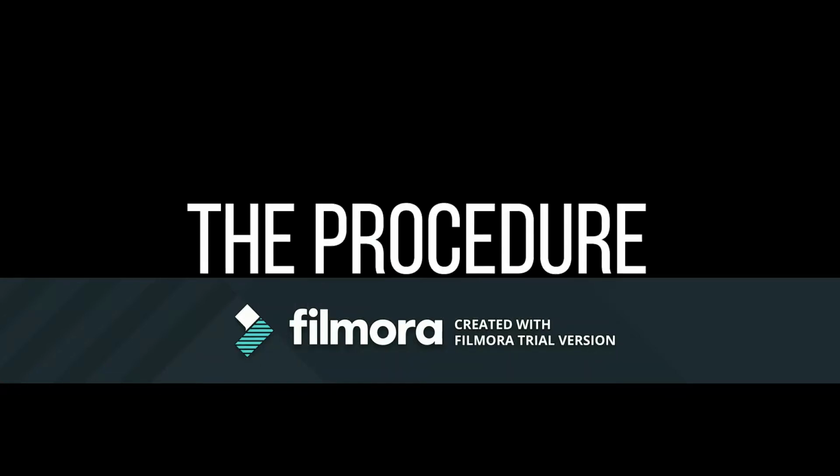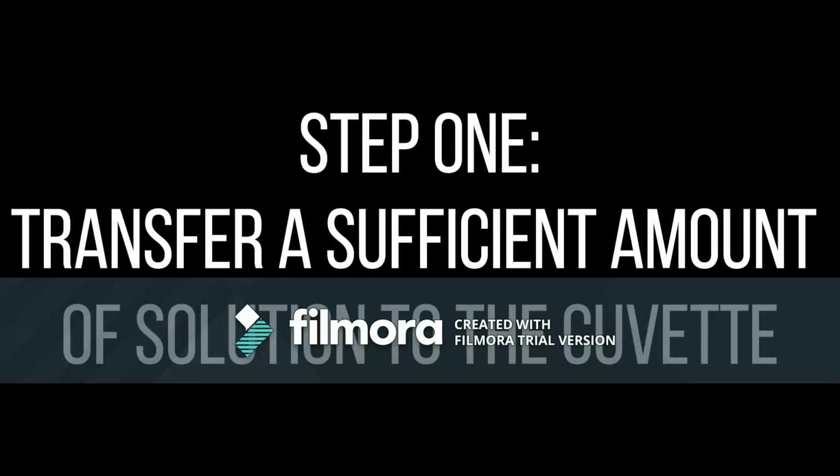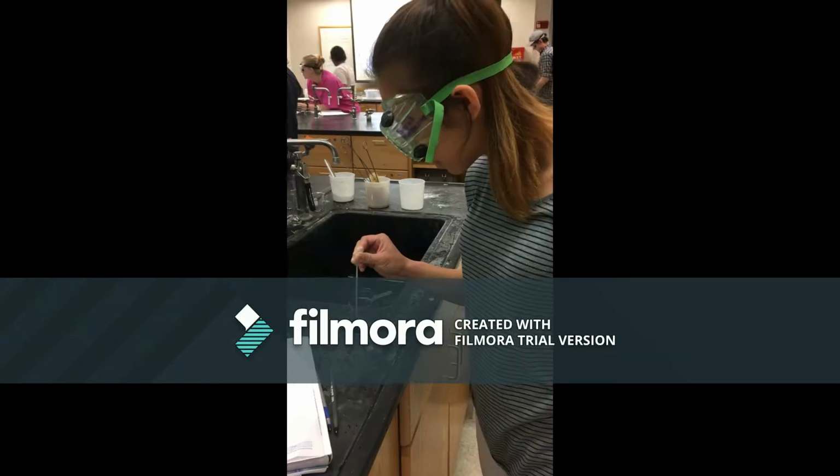The procedure. Step 1. Transfer a sufficient amount of solution to the cuvette.